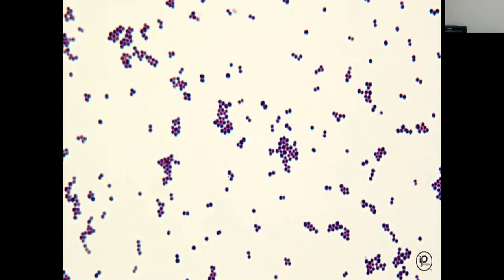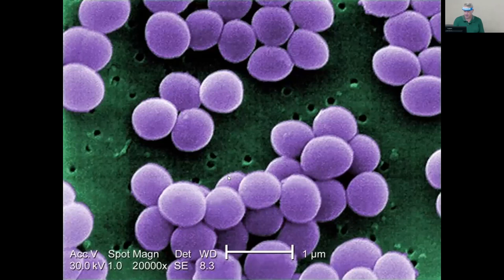So if you looked at it and you go, oh my gosh, everything's paired up, even the clusters paired up, and I can see that, then that would be your diplococci. This is our classic staph, grouped up. This is a great picture here showing it under electron micrograph, or we can color it just like grapes, okay? And that color's probably put on there on purpose, not that they look like that.